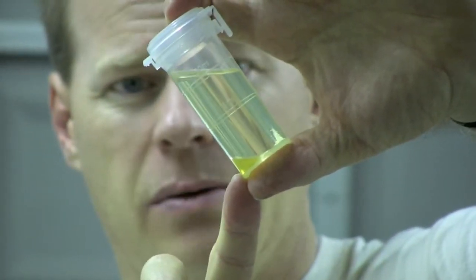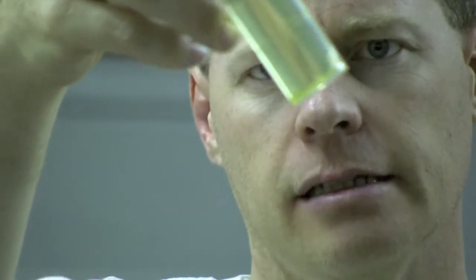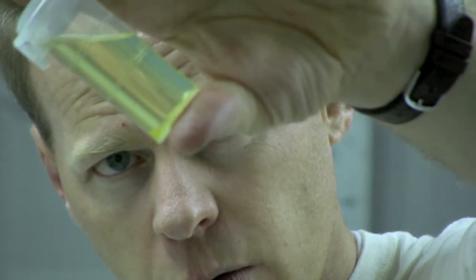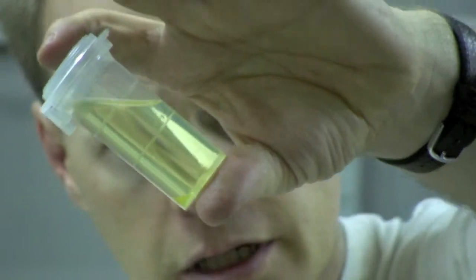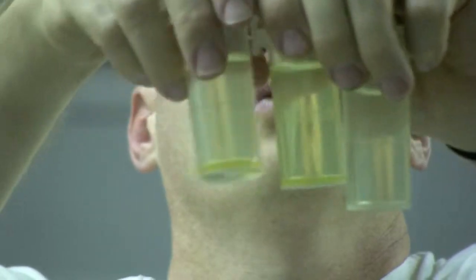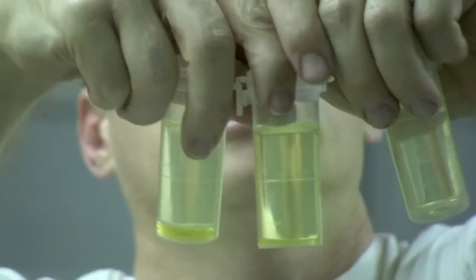We've got a lot of unreacted oil. This one was a little bit better, but we still got some unreacted oil down in that corner there that's coming up. And then this one is perfect — no fallout at all. One of the things you can do with these is you can tell just by the color of the biodiesel which batches weren't too successful. Notice this is our most successful batch.